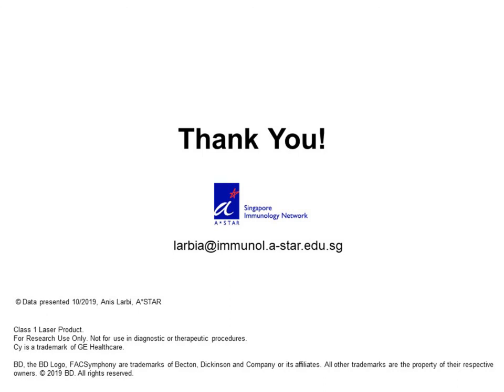There are also existing tools. If you follow the work from Pratip at NYU, you have the color wheel, which is a tool for the design of panels that integrates this aspect of staining index. If you want to do this, you can use the same clone for a high density marker, for example, conjugated with each of the fluorochromes that can be detected in your equipment.